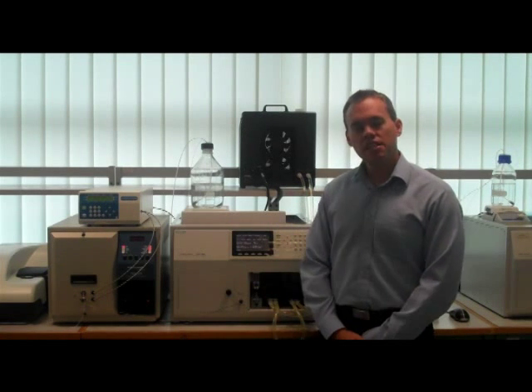Welcome to the Malvern Application Laboratory. I'm standing in front of the Malvern TDA Max system, which we use to characterize molecules in solution. The properties we measure are concentration by refractive index or UV, molecular weight with the addition of light scattering, and also this property of intrinsic viscosity, which I want to talk to you about now.